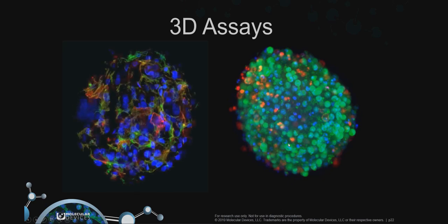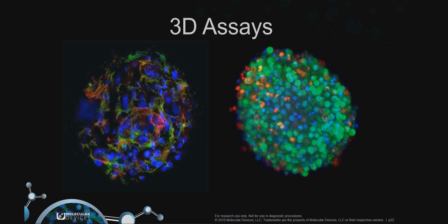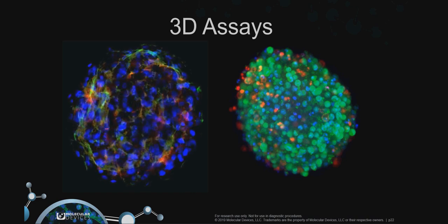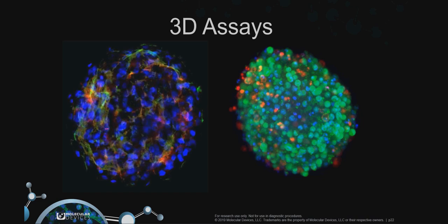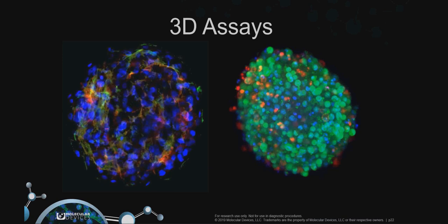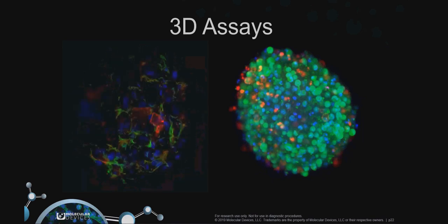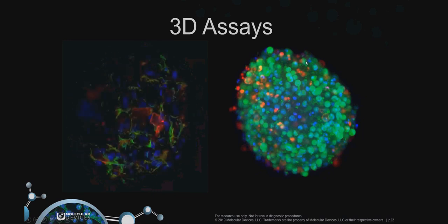Now I'm going to move into looking at some 3D assays, and this is definitely an area that there's been a lot of growth over the last several years, and we are seeing more and more customers interested in moving into these 3D assays, as well as more options, more formats available with regard to different optimized 3D plate types as well as sample formats and so on. Here you see an example of stepping through in Z of a spheroid where we're looking at markers here for viability as well as markers for different cell structures. And on the right, you're looking at the projection.